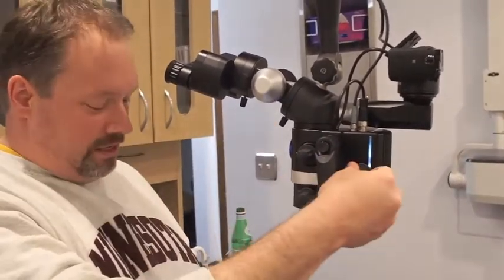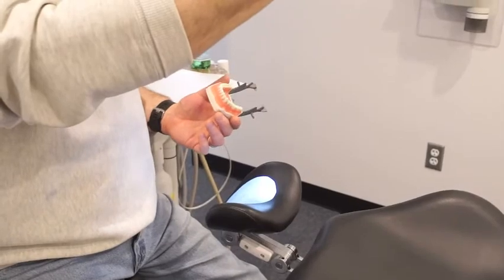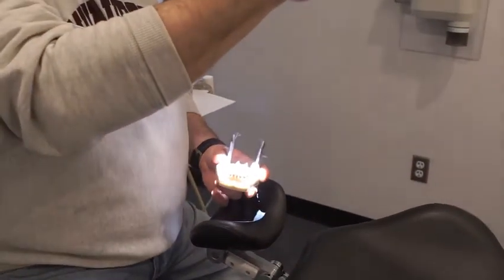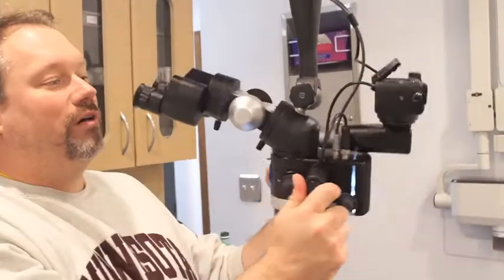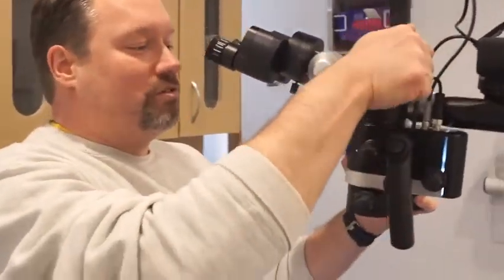Features, though. Look at that. I mean, like, the little, I don't even know what you call it, the iris that closes or whatever. God, why don't they do this? This is amazing. I mean, it's so important. That's the diaphragm for stopping down the spot size of the illumination. Amazing. And the balance on this little ball, it's like it's floating there. The movement is just ridiculous.